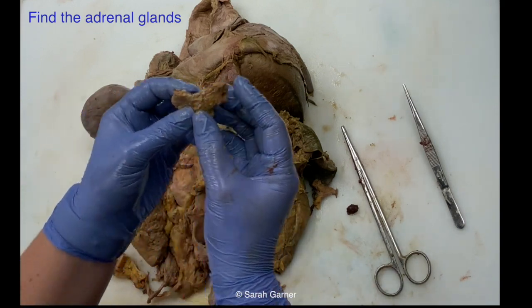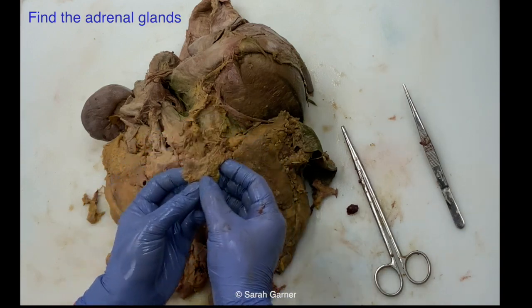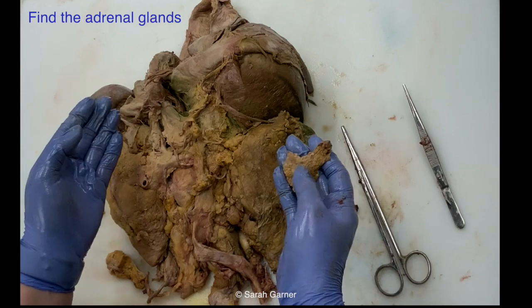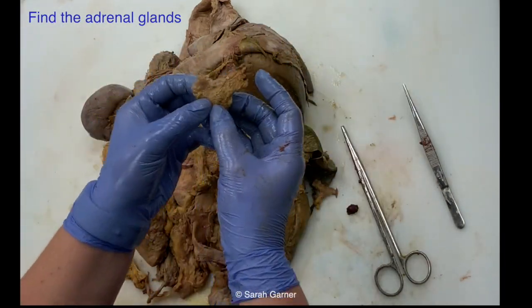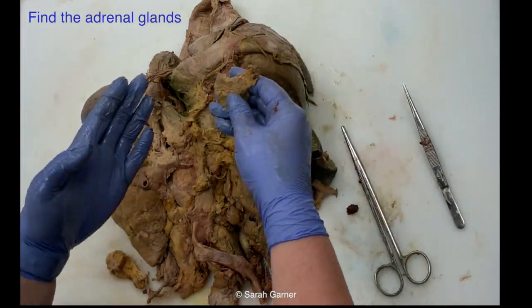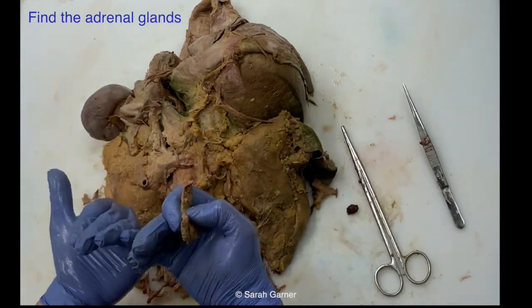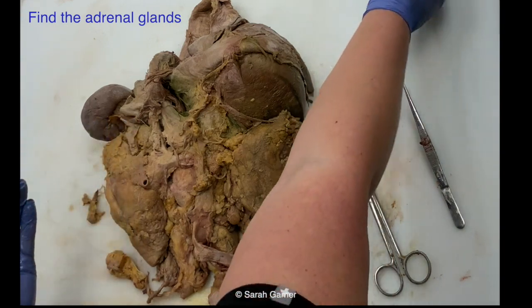Now, I will tell you, when you're setting this down, put it where you know what side is what, because once you have everything removed and no reference structures anymore, if you just have organs sitting out and you don't know what's right and what's left, that can become problematic. So I like to set organs as if they were on the block. When I do this, I put it down on the right, because if this was my organ block, it would be sitting in me like this anyway. So with my right hand, this is the right adrenal, and it'll be sitting on my right.